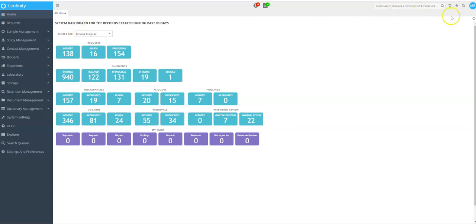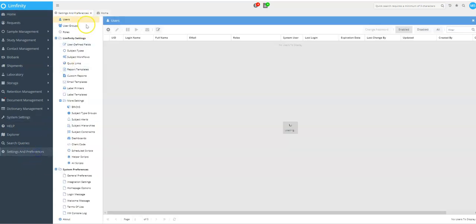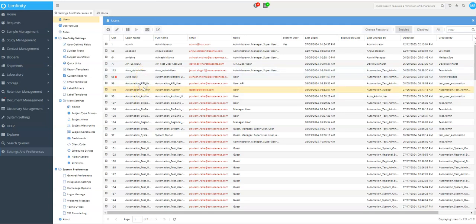You can also access all of those same types of logs on an individual subject, which I've shown in the individual subject general screen video. Finally, if you are an administrator of the system and can access user records on a specific individual user, you can do an audit. So you can look at the audit records for that specific user using a right click and the audit records on that user.